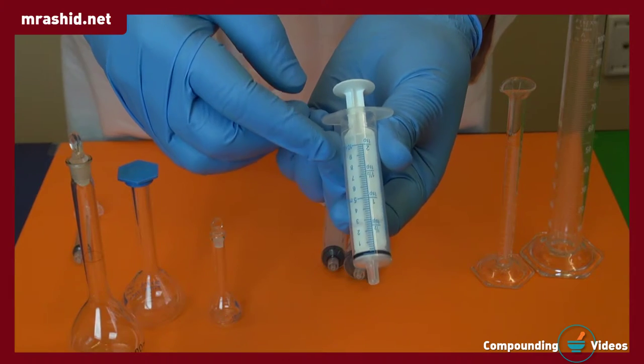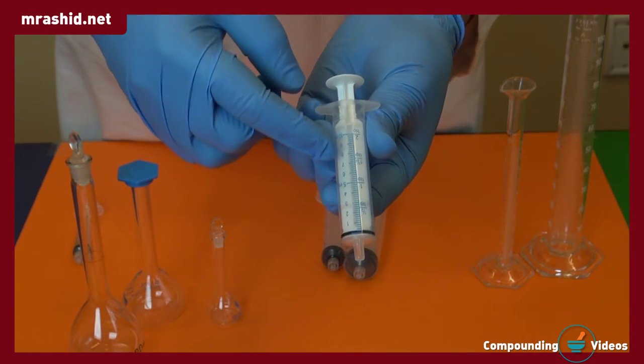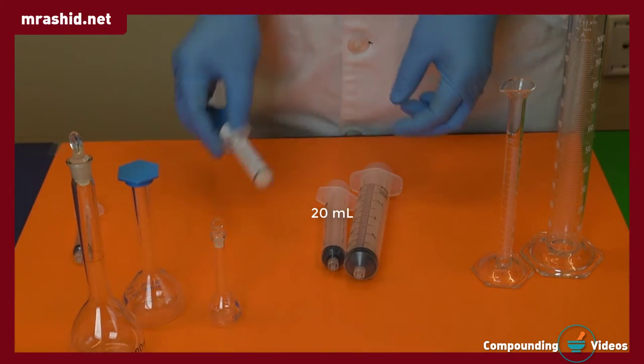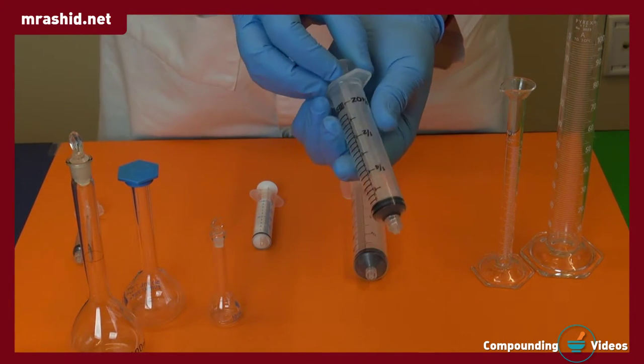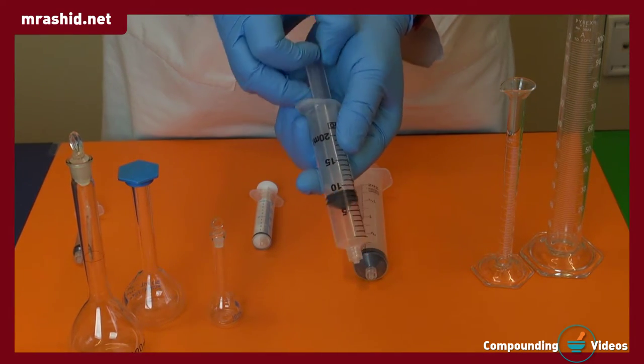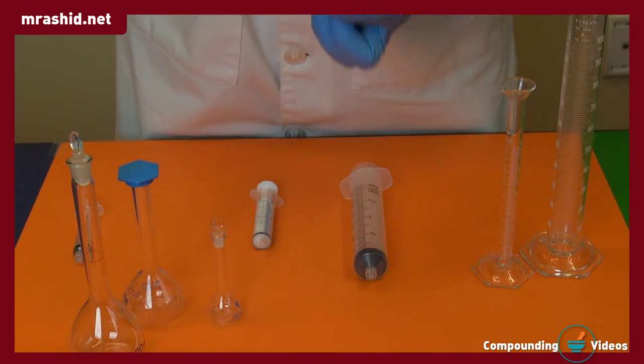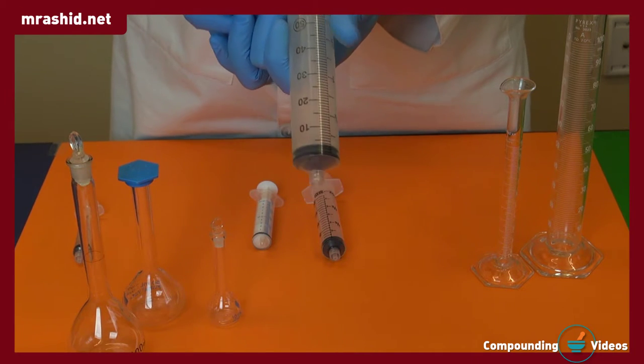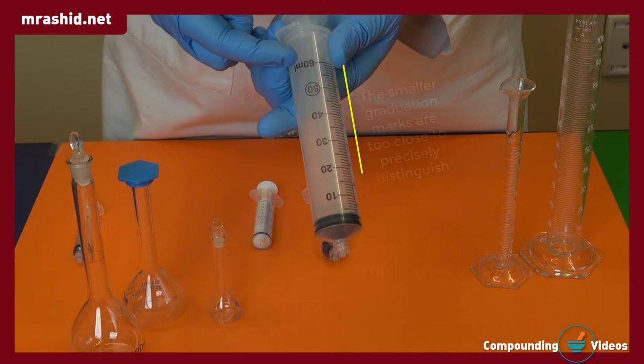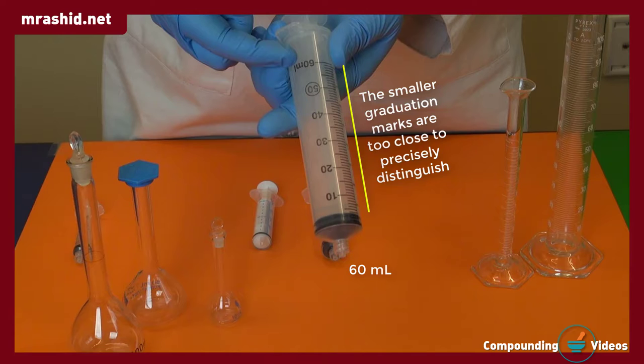This one is 20ml. It still may be used with a slightly higher degree of error. But this one is the least accurate of these because its capacity is 60ml, which is six times our measurable amount.